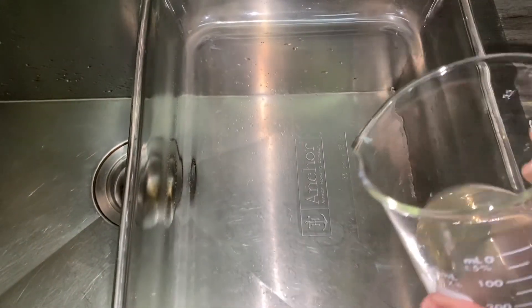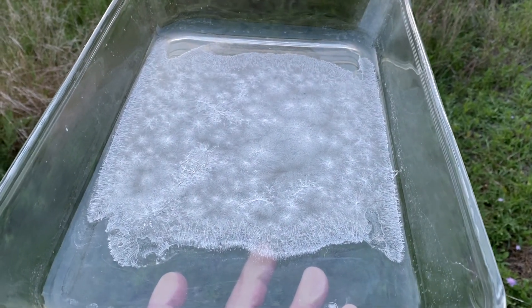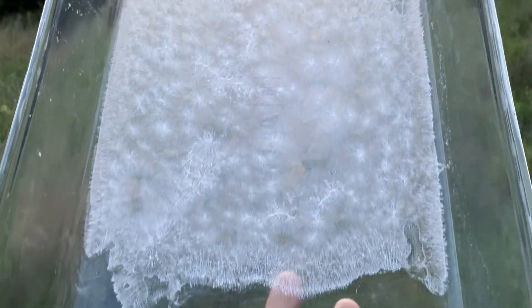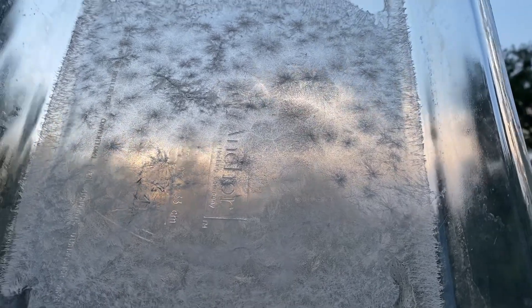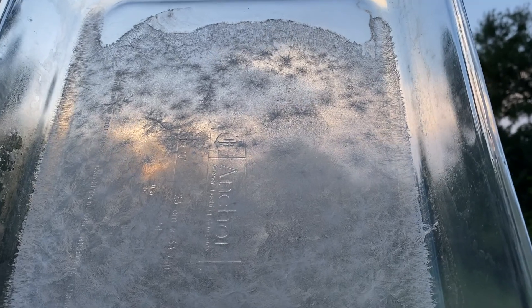Here we are after drying out the CBG-alcohol mixture, and we have pure CBG crystals. They have a really neat pattern — almost like spangling, like what you see on galvanized metal.